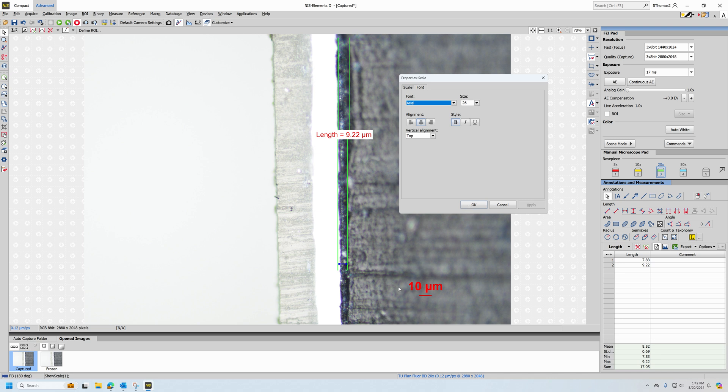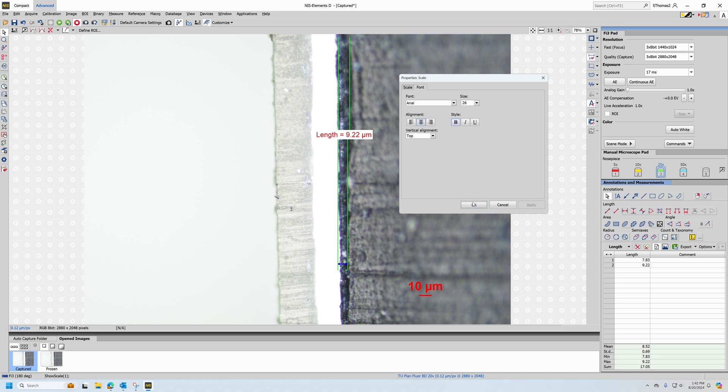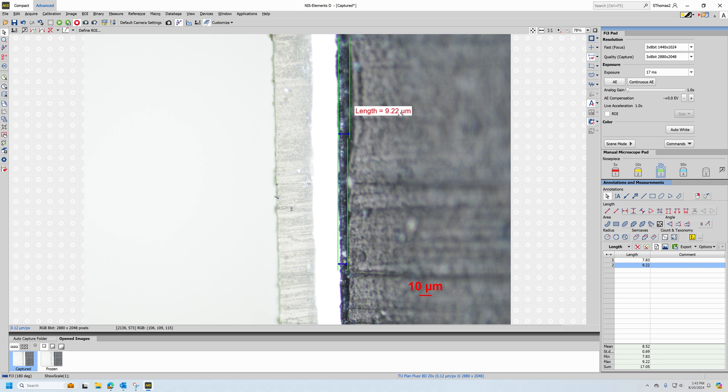If I'm happy with the scale bar, I can left click OK. Then if I want to readjust my line measurement results, I can hover my pointing tool over the measurement result box, left click to select it, and then left click, hold, and drag to reposition my measurement result.